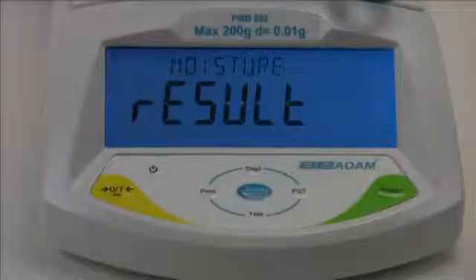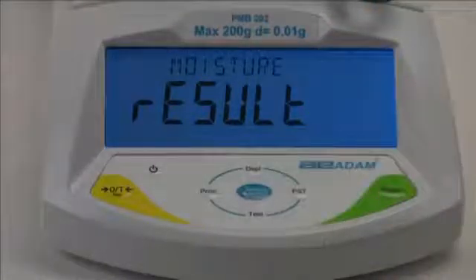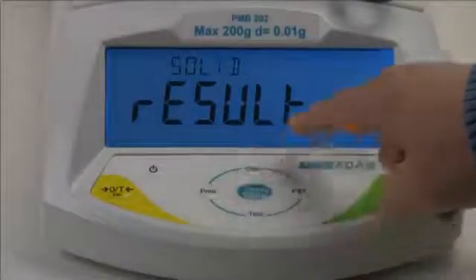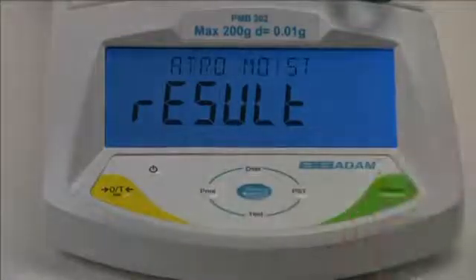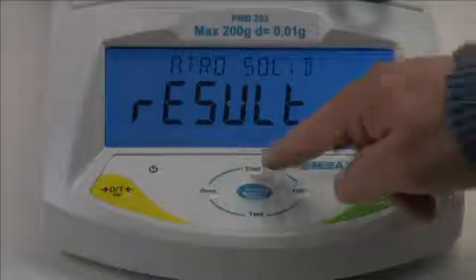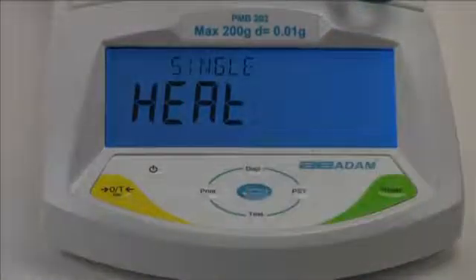Moisture displays the percentage of moisture content of the original sample. Solid displays the percentage of solid remaining after moisture has been driven off. ATRO moisture displays the percentage of moisture relative to the dried sample mass. ATRO solid displays the percentage of solid relative to the dried sample mass. We'll select moisture by pressing the enter key when moisture is displayed.